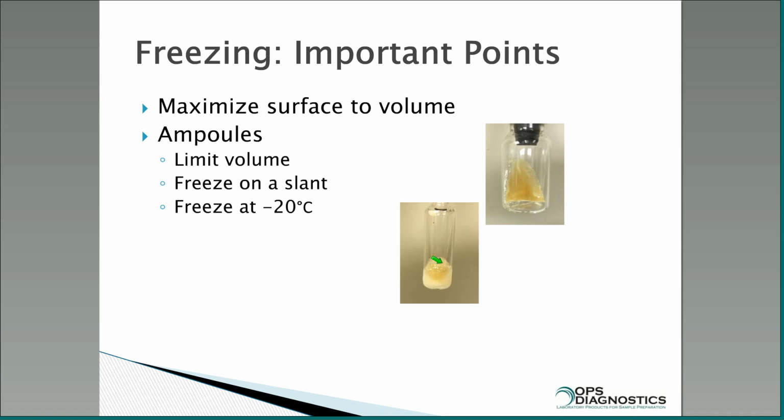This is an ampule. You can't see this. I took a bad picture, I apologize. But on the back side of this, it's at an angle. So this one is also, I'm trying to maximize that surface area.